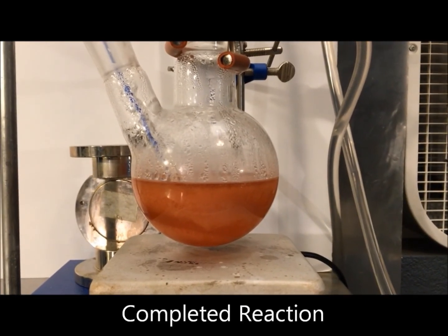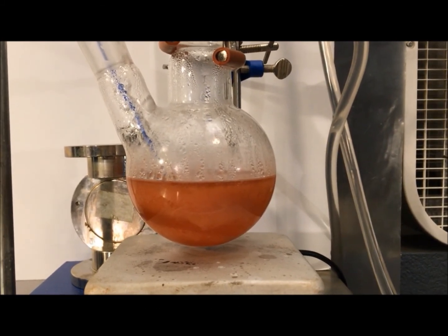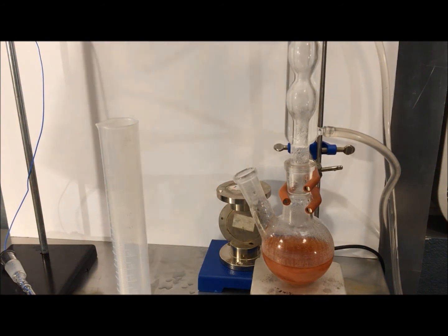So here's what it should look like when it's finished. Next we'll transfer it to a graduated cylinder so we can measure the amount of product.